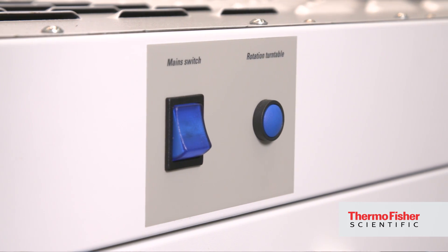One of the unique features of the Cytomat 10 is the so-called ContraCon method, adapted from the well-known manual incubator HERA cell. That allows us to decontaminate the interior of the Cytomat by just pushing a button, which is also very unique to the industry.